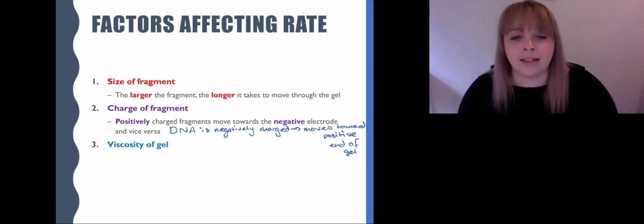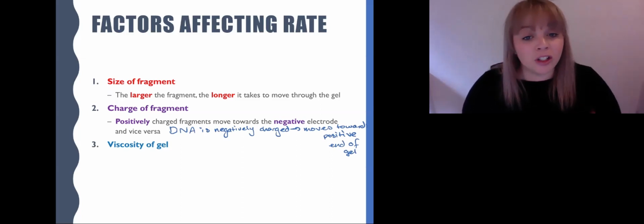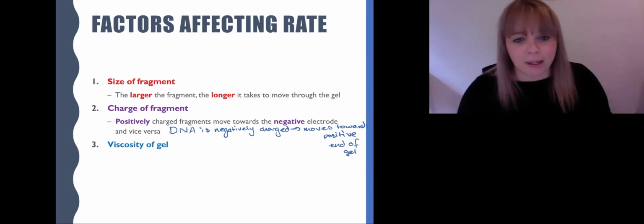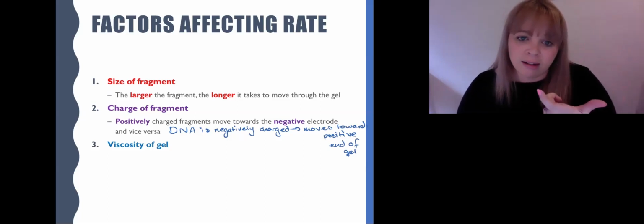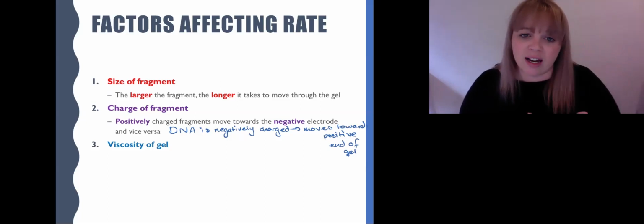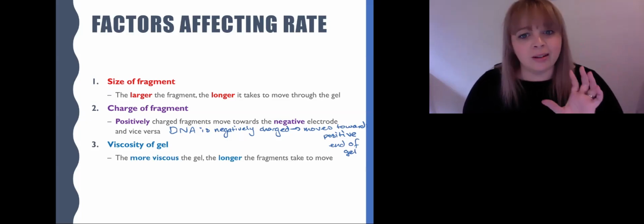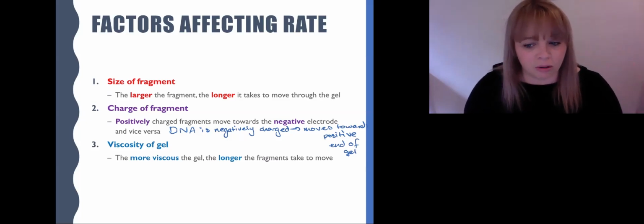The next thing that's a little bit harder is how viscous your gel is. Every gel is going to be slightly different in terms of viscosity. Some of them might be a little bit thicker than others. Some of them might be a little bit thinner than others. So think about it. If it's a thicker gel, the more viscous it is, what is that going to mean about how fast they can move through the gel? You can have a think. Hopefully you said the more viscous something is, the longer it takes for it to move.